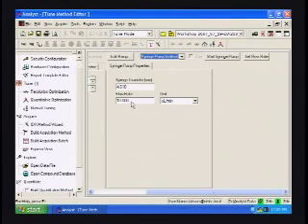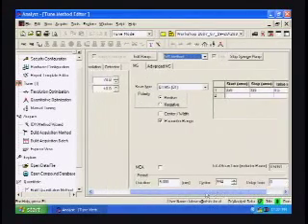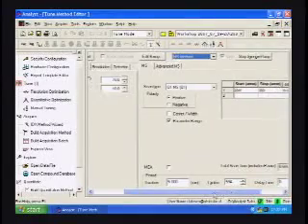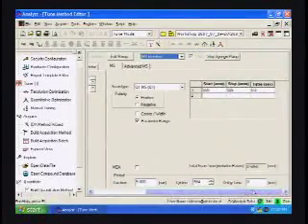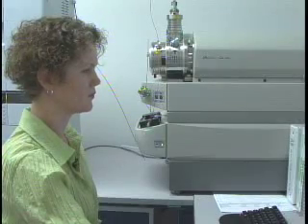Let's try this. We'll set our flow rate for our syringe pump. It's not going very fast, just 10 microliters per minute. Let's go back to our mass spec method and check our parameters. It's going to give us a 5-minute duration period so we can have a nice window to check and make sure we're getting a good signal. I don't think we need to change anything else. I think you're set to go. Okay. I think so too.